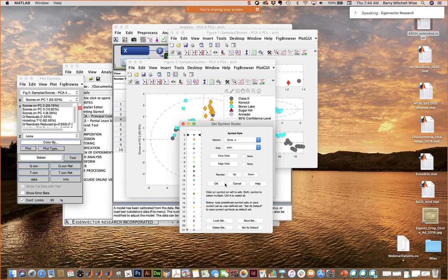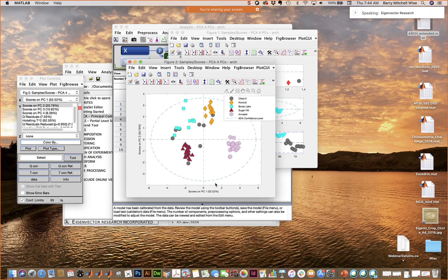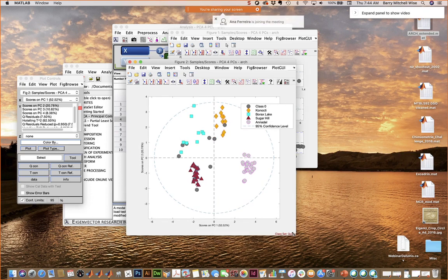Especially you might have some instances where it makes sense to associate classes with different colors, etc. I'll also point out that we had a question from a user the other day about symbol sets that work for people that are colorblind.